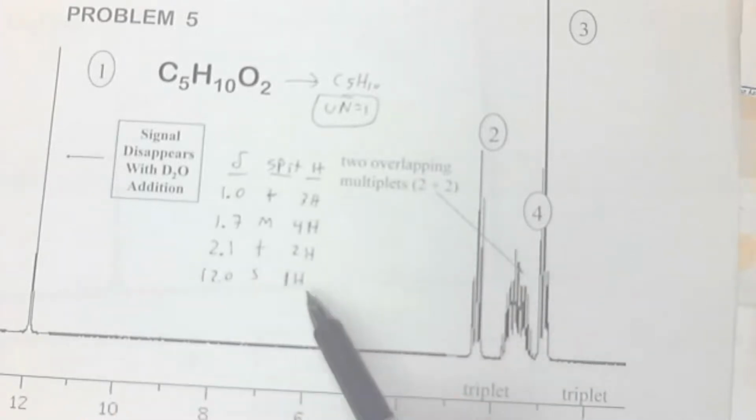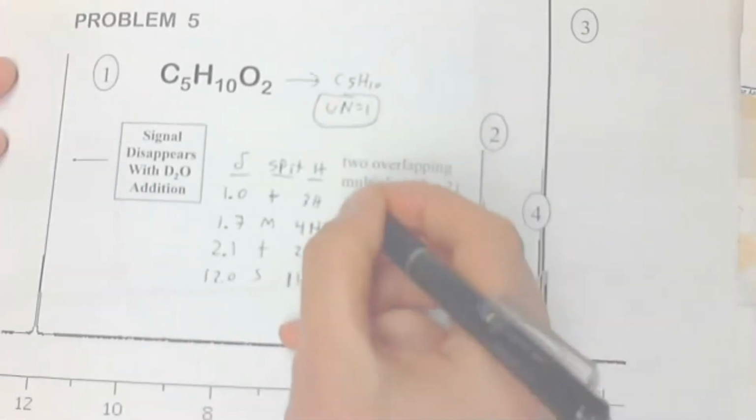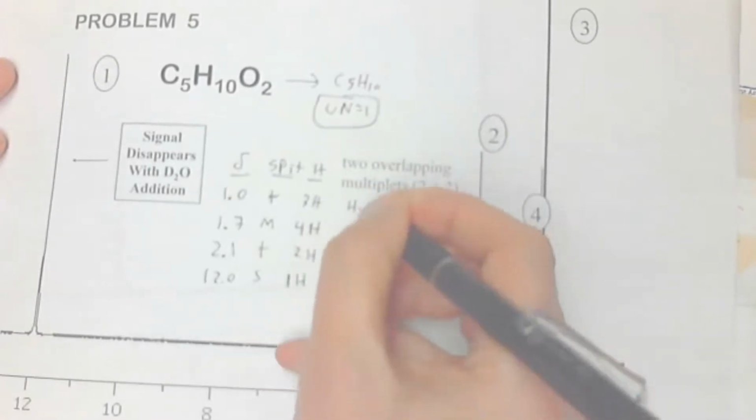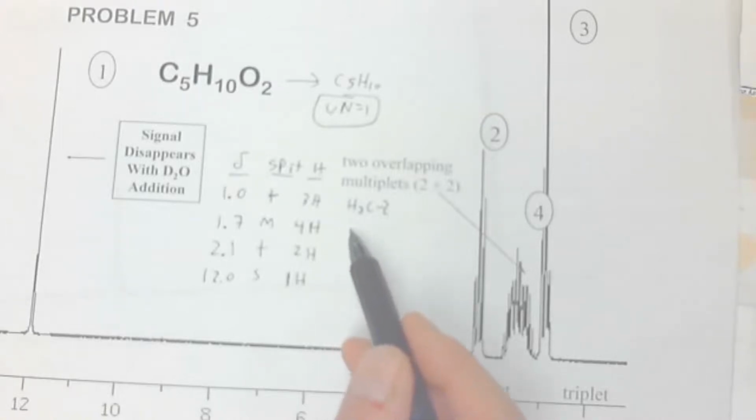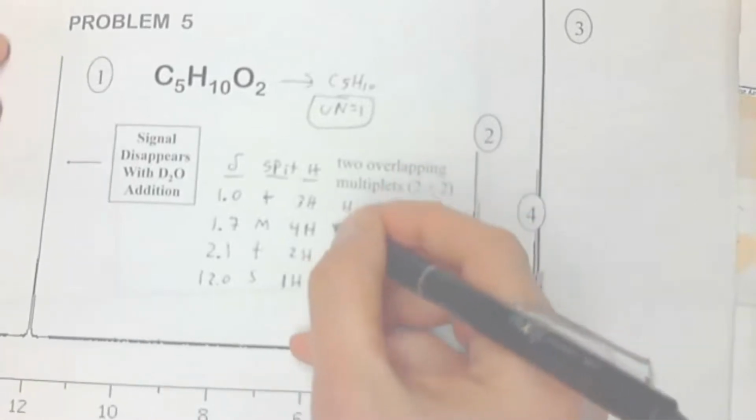Let's just do our substructures now, CH3. Now the 4 might be weird to you because we haven't seen that yet, but sometimes peaks just come at the same place. And so it's probably a pair of CH2s, just 2 CH2s.